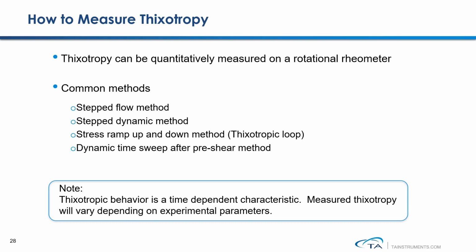But please note, thixotropic behavior is a time-dependent characteristic. So the measured thixotropic index value will vary depending on your experimental parameters. So if you would like to analyze the thixotropic properties of a series of materials, please stay with the same test method and same testing parameters.